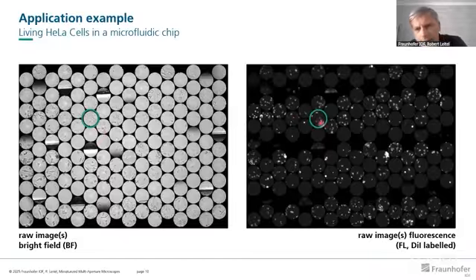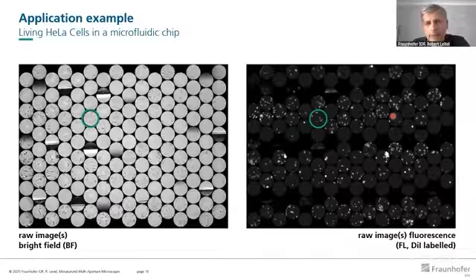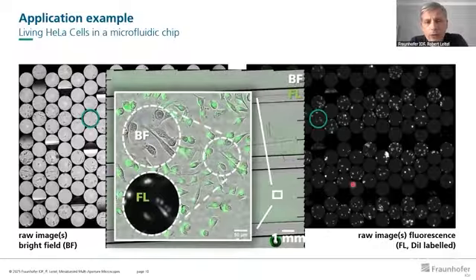I hope you can see that there is again this scan line here where you scan multiple channels in one linear direction, and then from that one could stitch and overlap the information from a quite large field of view. So from here, a total field of view much larger than 10 by 10 square millimeters.